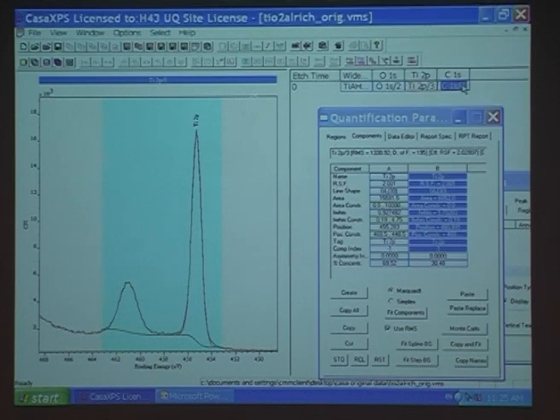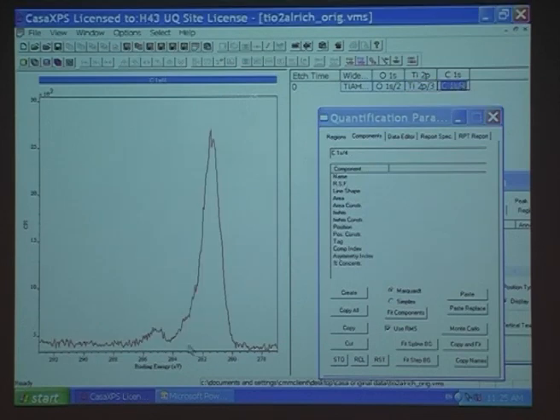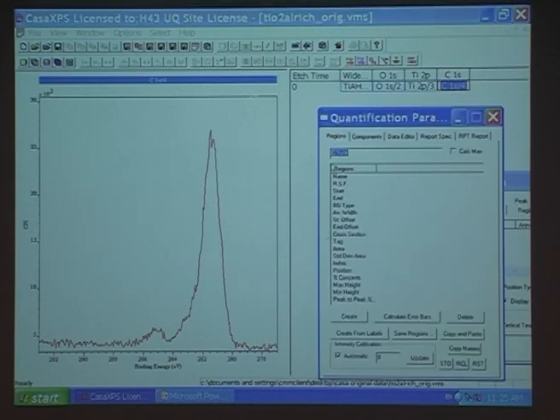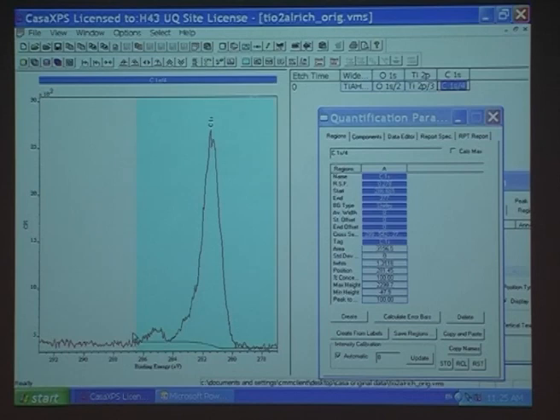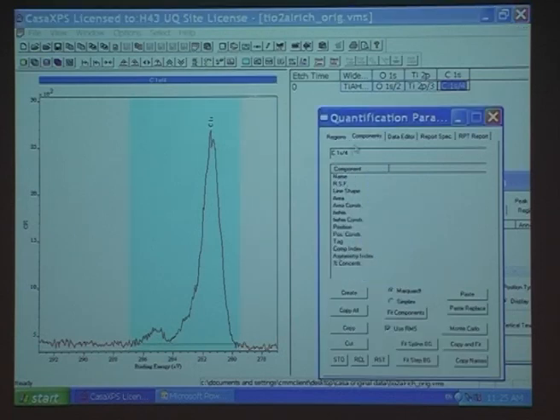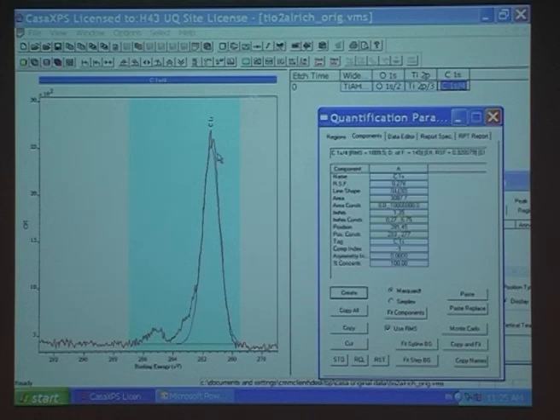Go to the carbon. We needed that. This looks similar to the carbon on the cadmium sulfide. Okay? Typical junk, as I say. It looks very similar. Not interested in resolving it again. I'm interested in getting an accurate measure of the peak here. So region, create. Bring this into here. I try to select the midpoint of the noise. You don't select a high point or a low point, but somewhere in the middle. Component, create. Oh, that's not too bad.